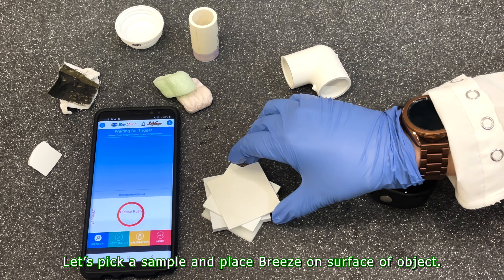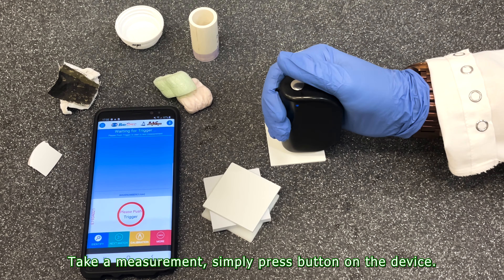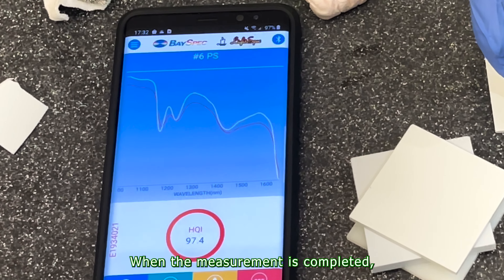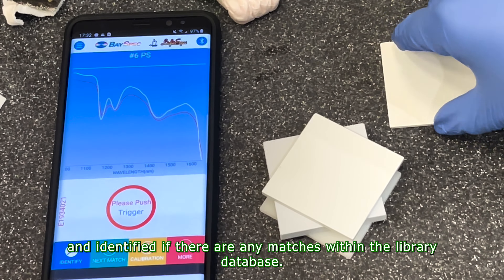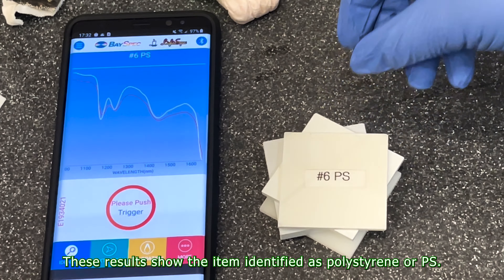Let's pick a sample and place the Breeze on the surface of the object. To take a measurement, simply press the button on the device. When the measurement is completed, the spectrum will be displayed on the screen and identified if there are any matches within the library database. These results show the item is identified as polystyrene or PS.